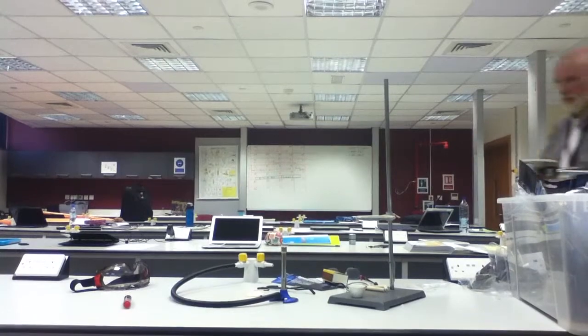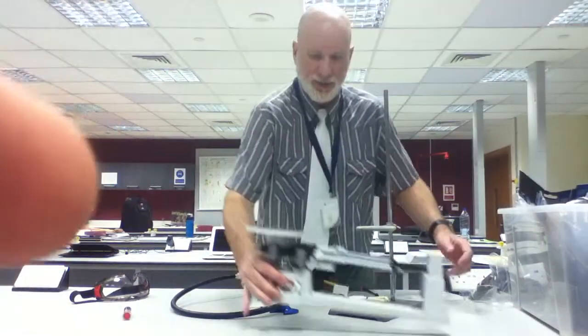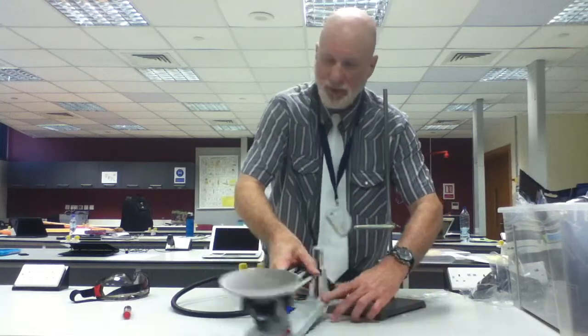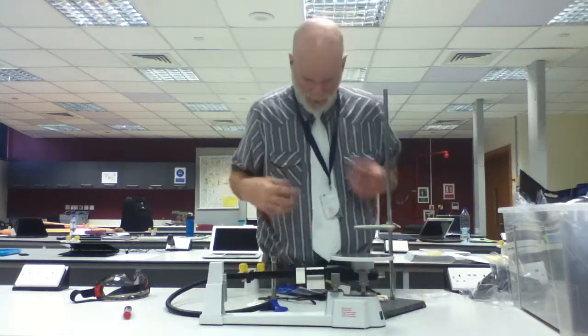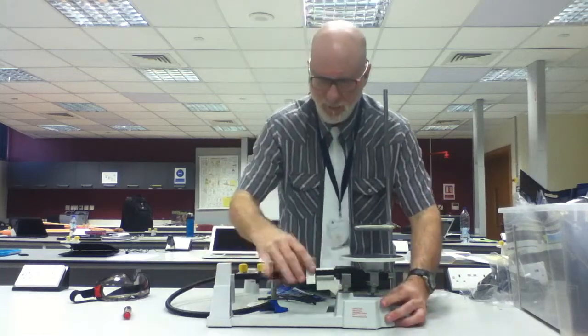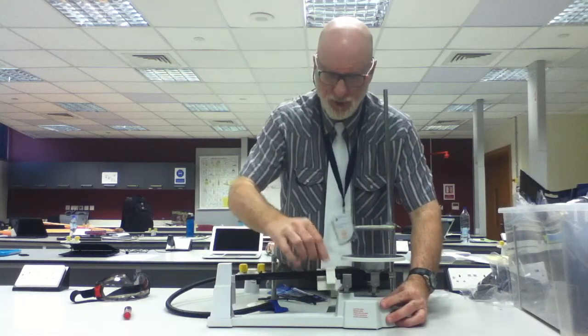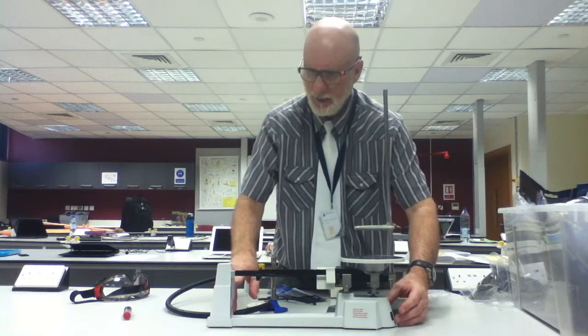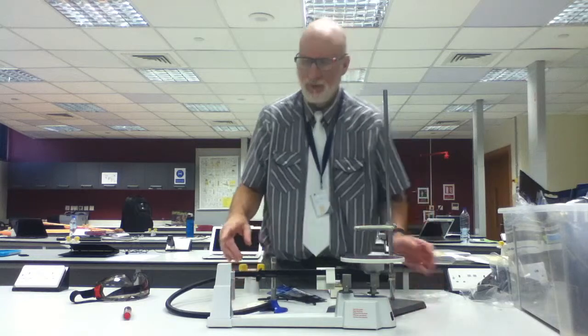So here is the balance. First thing I'm going to do is zero it. Make sure these are all at zero. Then I say it is zeroed.